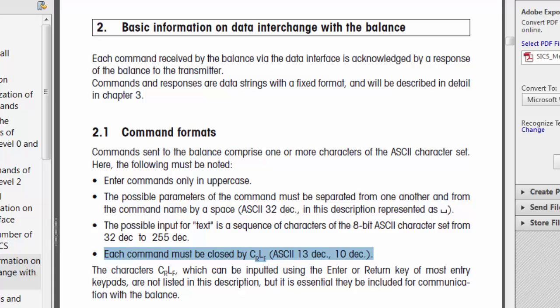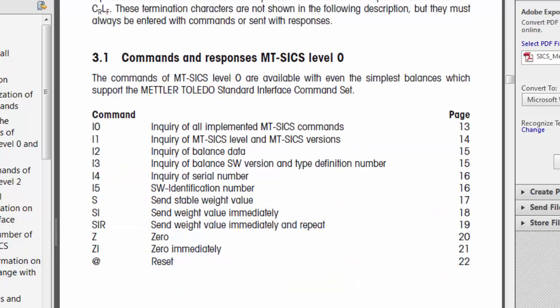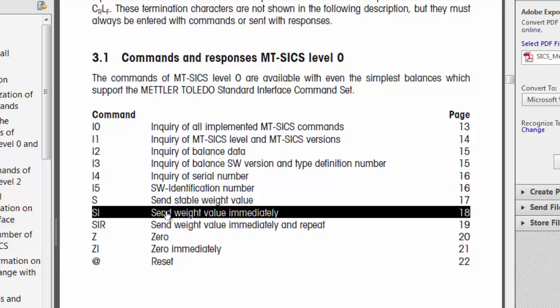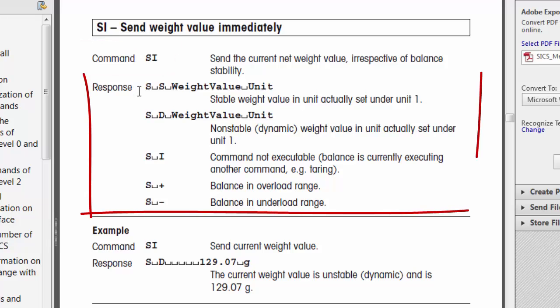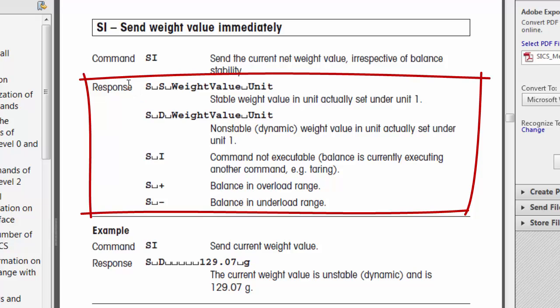Those are just some general details on how to communicate using this protocol. Now we're going to look at our specific command. We'll go to the level zero commands that are available — we want to send weight value immediately. As you can see, it gives us the command syntax that we need to be sending to the scale and the response formats that we can expect to get back from the scale.